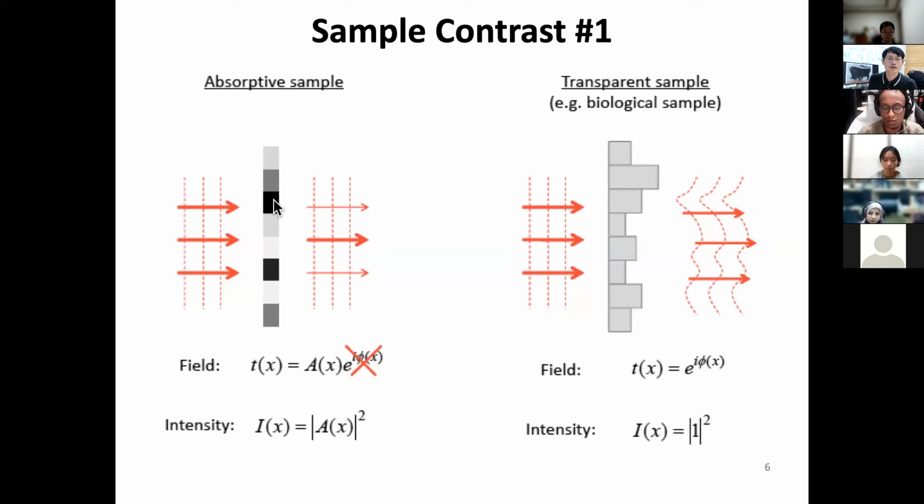So how can we describe it in an easy way? Let's make rays and a wavefront, and this is flat. Let's assume there's no phase retardation spatially. Then the wavefront will still be the same. However, through this darker part, you definitely have a lower amplitude. So you can see the arrow is a little thinner here.